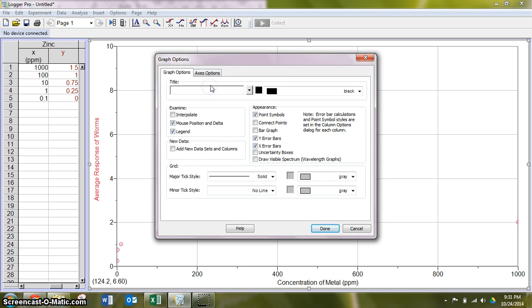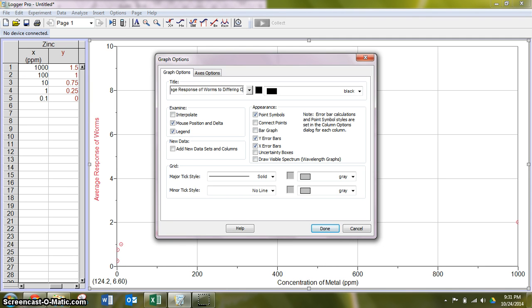My title, average response of worms to differing concentrations of metals.